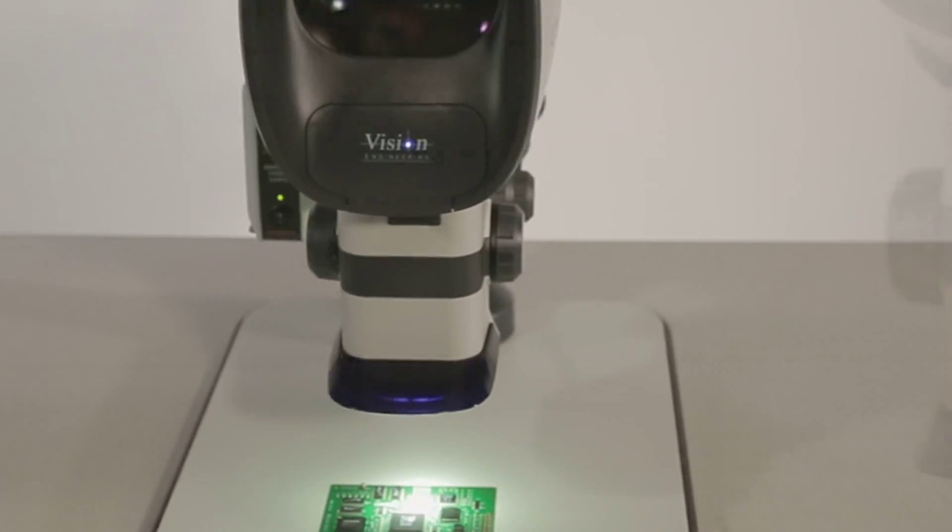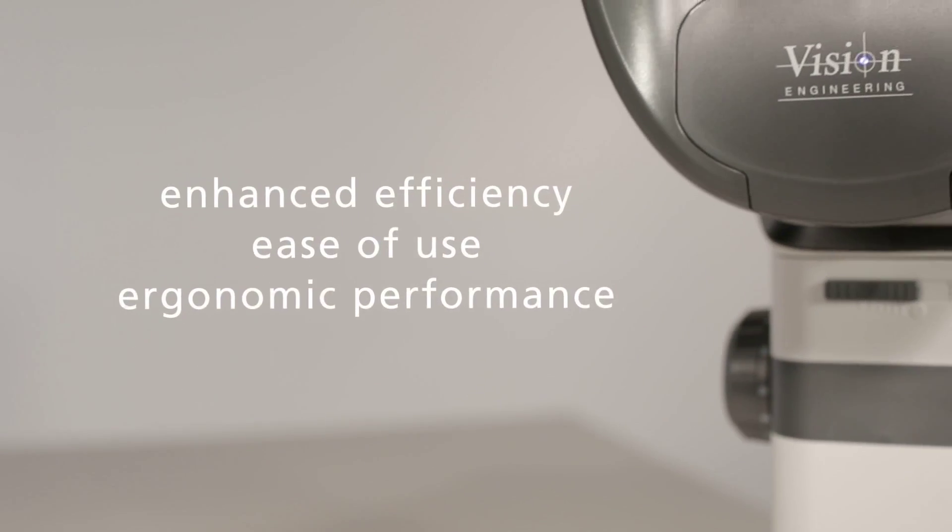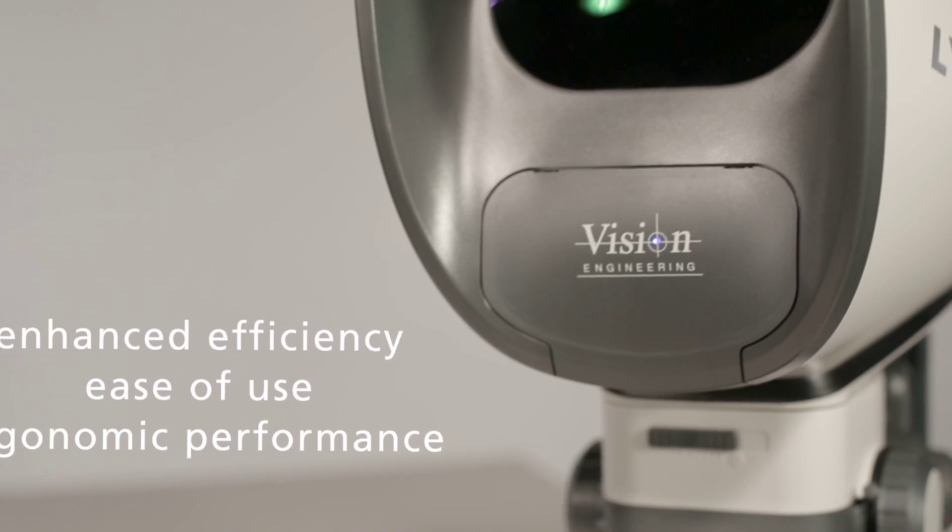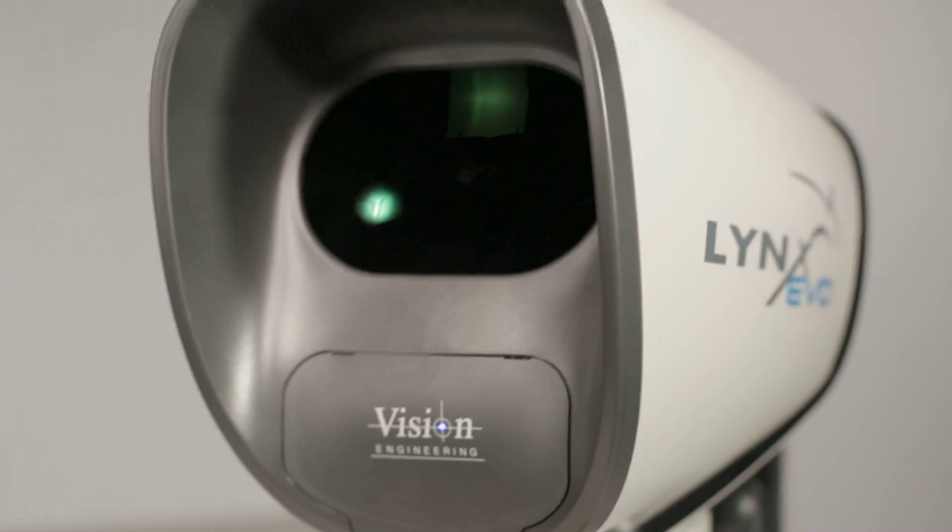Lynx Evo's unique patented eyepieceless technology opens up a world of enhanced efficiency through unrivaled ease of use and ergonomic performance.